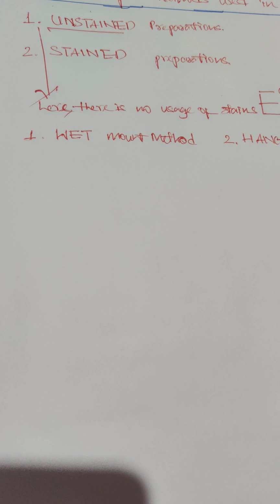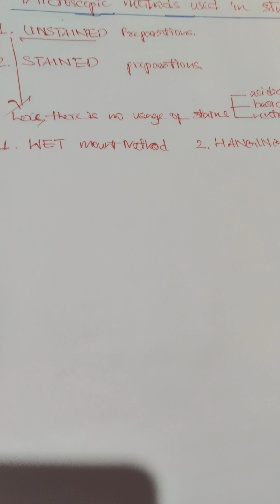Stains, S-T-A-I-N, basically means in layman terms that we color or dye the microorganisms after fixation, to enhance their visualization.